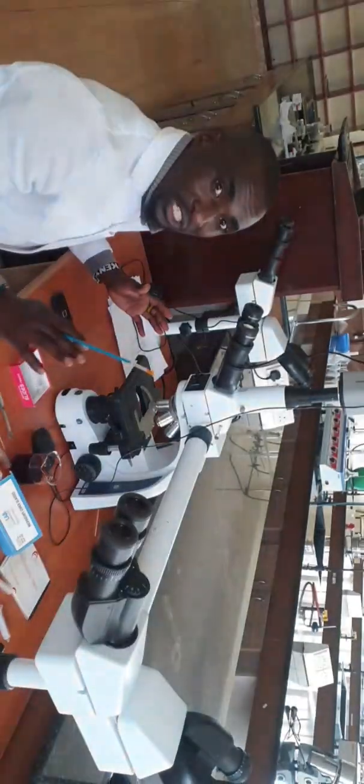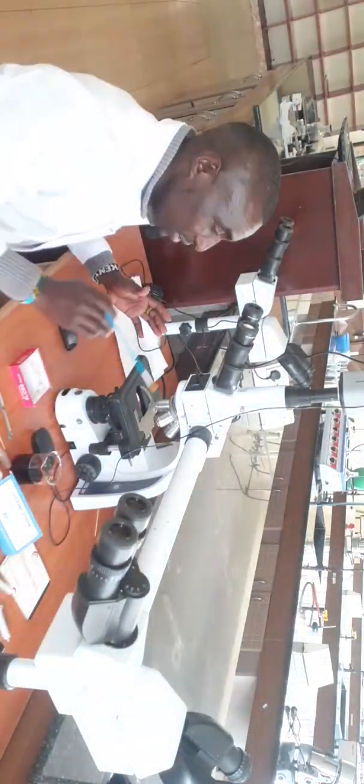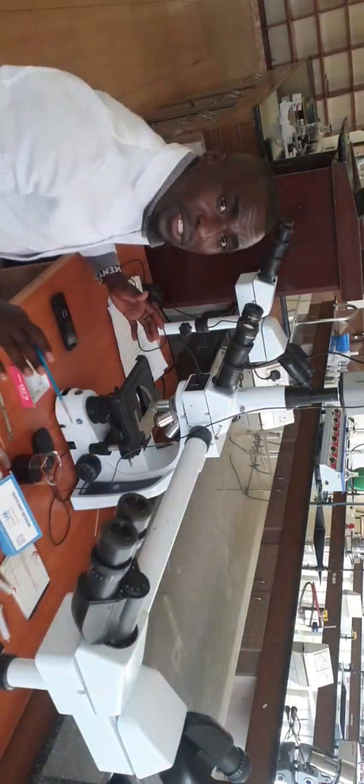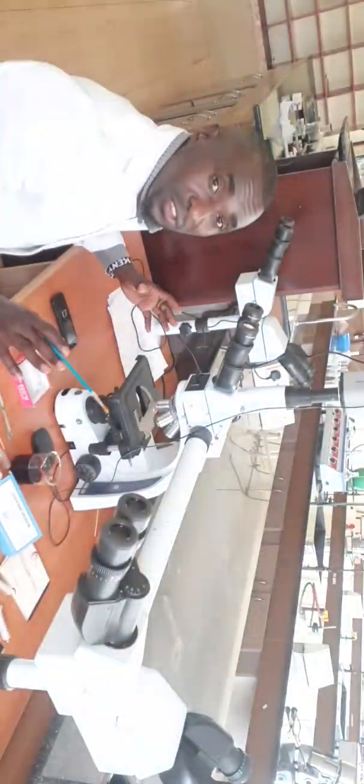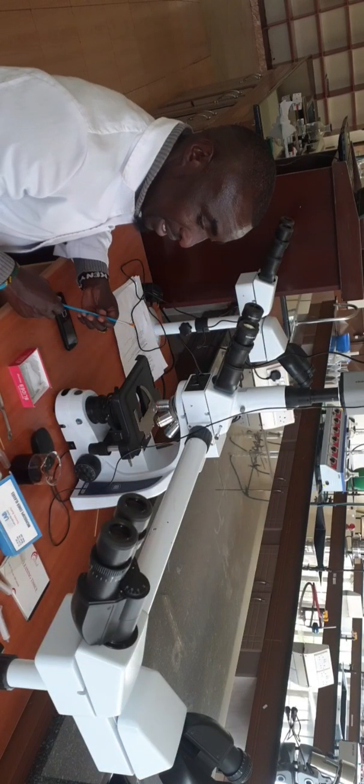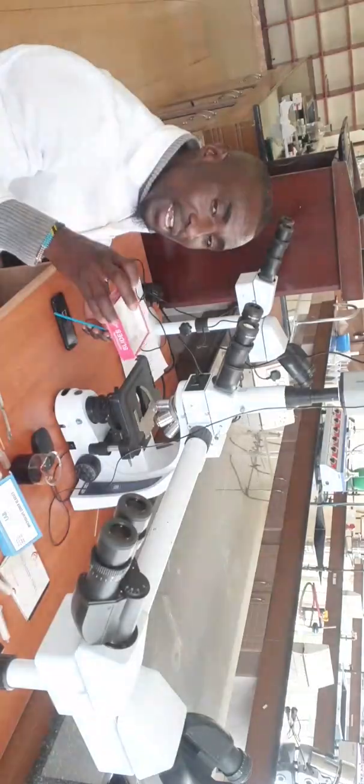Specimen on the stage. It has been placed on the stage in this process. Now, what is involved in microscopy? What is involved in microscopy is that you must have a slide.